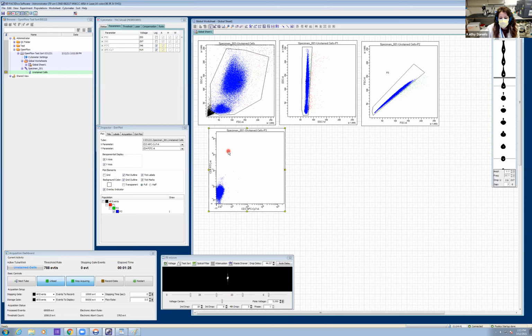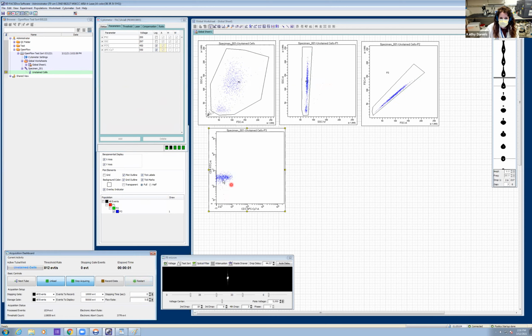Okay. Now I do have some values for the fluorescent voltages that we've set up in our facility based on instrument characterization. So I'm going to go ahead and put those values in right now because I have them here to the side. And again, this was based on a voltage characterization that we've carried out. Sorry, I meant to use 550 there in our facility. I'm not arbitrarily changing these values.